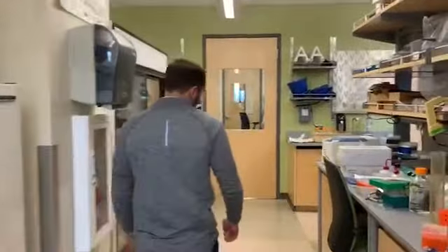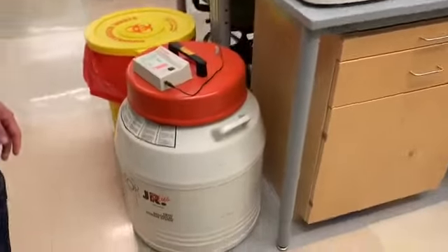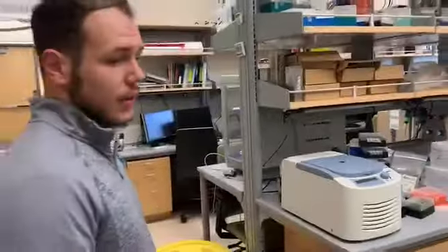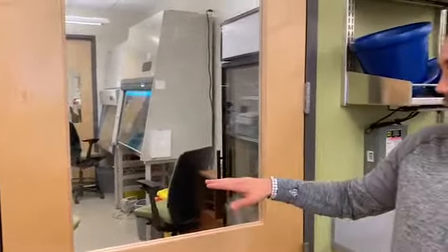We keep all of our cells here in this liquid nitrogen tank, and so we have a lot of cell cultures and cell lines here. And then we have just a basic lab, and then we have our hood here, and we keep our cells incubated in that station over there.